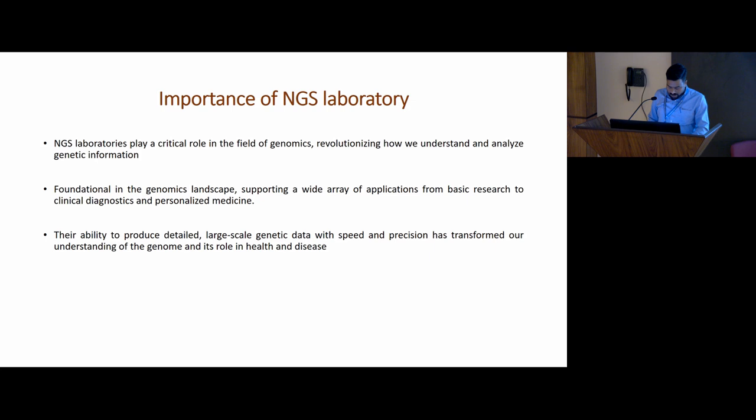So, the importance of the NGS laboratory. NGS laboratories play a crucial role in the field of genomics, revolutionizing how we understand and analyze genetic information. They are also foundational in the genomic landscape, supporting a wide array of applications from basic research to clinical diagnostics and personalized medicine. Their ability to produce detailed and large-scale genetic data with speed and precision has transformed our understanding of genomics and its role in health and disease.